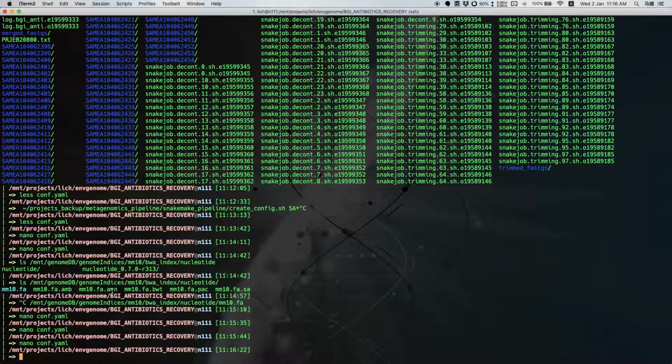Yeah, all the ones you highlighted, I'm not so sure. For I in the library prefix. Yeah, do your job submission with the run Kraken 2. Yeah. And that part, I don't know. So it's the same. It's like read 1, read 2, right? Yeah, it's the same idea. But the bracket, I don't see any closing bracket, so I'm not so sure. No, you have to. I don't think you copied correctly.